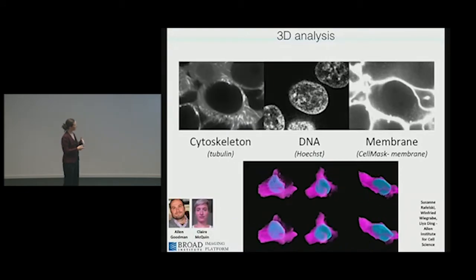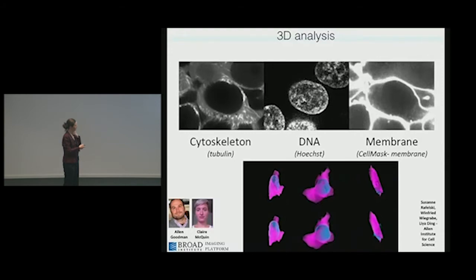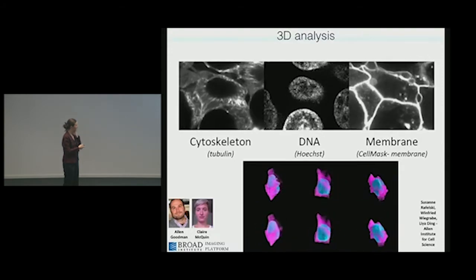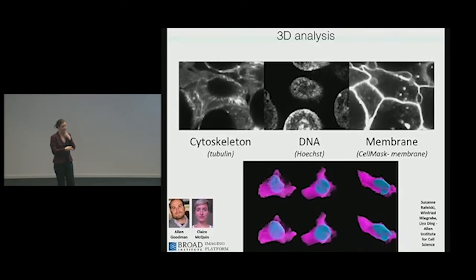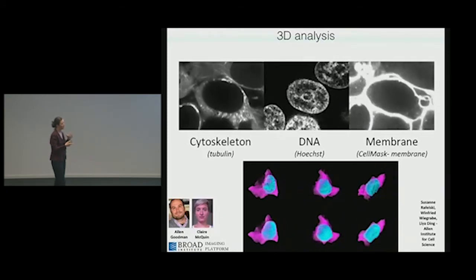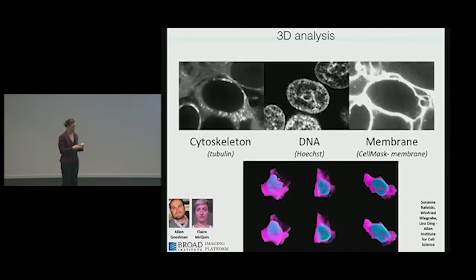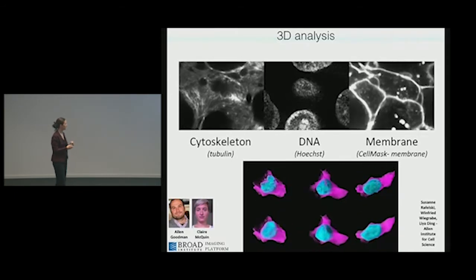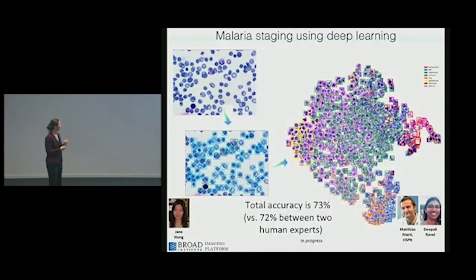The things we've been working on in this domain as well are three-dimensional analysis. And if you download Cell Profiler next week, you can test out this capability. This has been a really great collaboration with the Allen Institute for Cell Science, which is collecting a lot of large-scale 3D time-lapse imagery. And I encourage you to check out their Cell Explorer. It's a really great resource, and also a lot of pretty pictures to look at that they've captured.